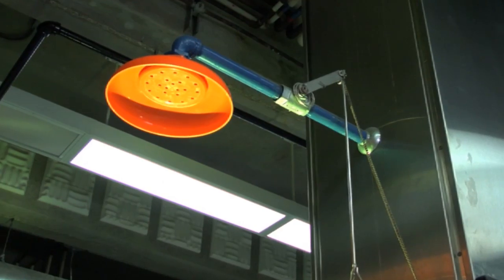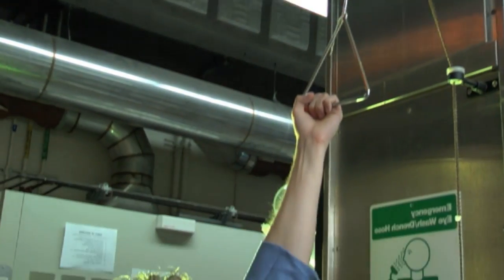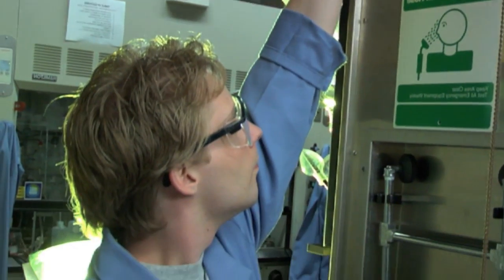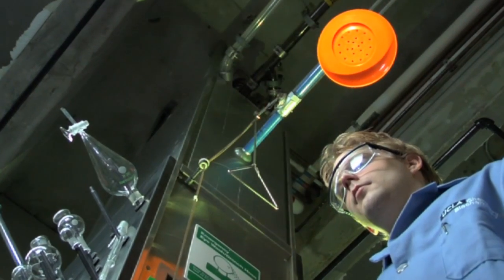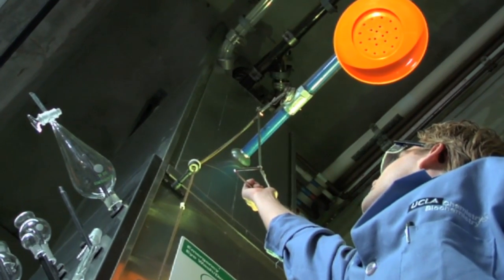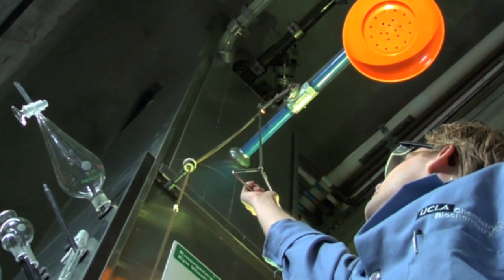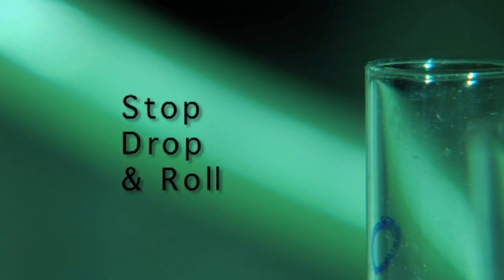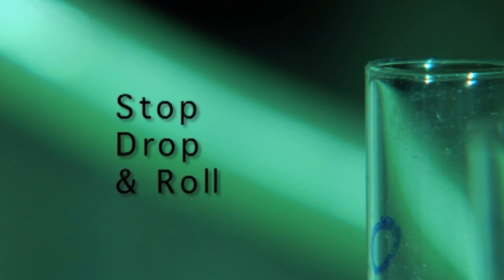If your lab coat catches fire, immediately remove it and use the emergency shower to douse the flames. Use the shower long enough to remove any contaminating material and cool the skin and body. This minimizes damages caused by burns. If a shower is not available, then stop, drop, and roll.